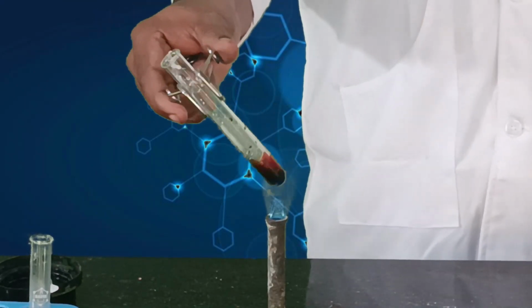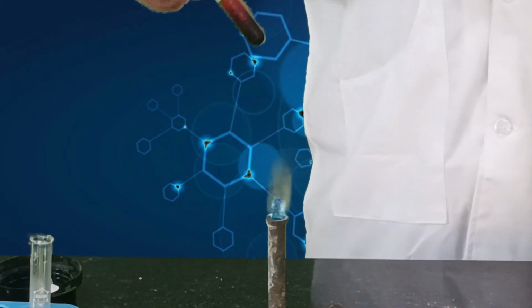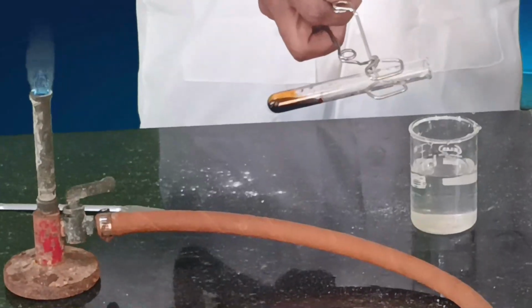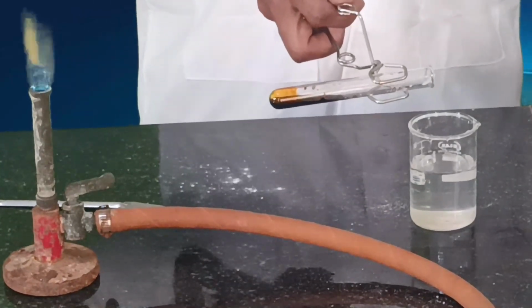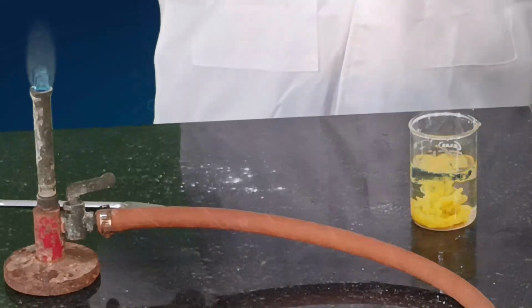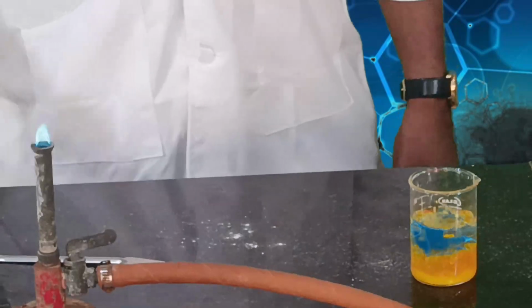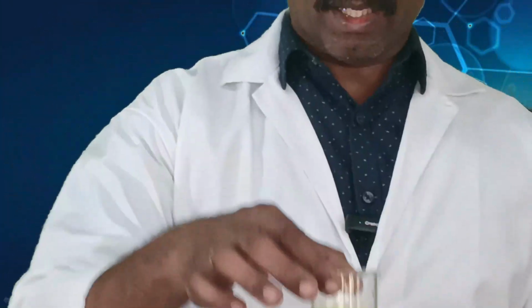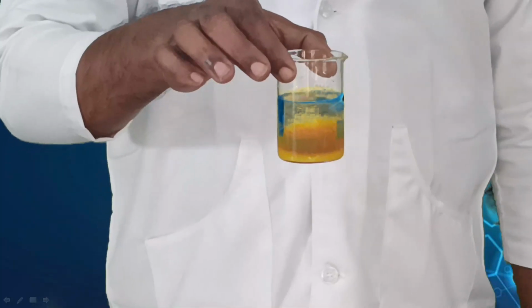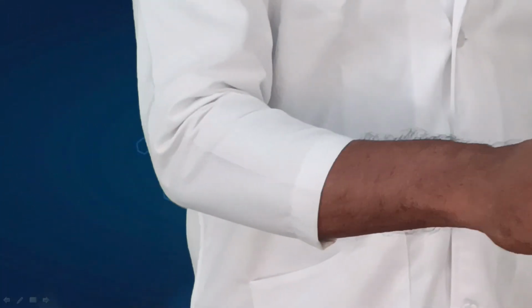Once it turns into dark color, add 1 drop of this to the already prepared sodium hydroxide solution in the beaker. Just 1 drop is enough, and you will get a beautiful fluorescent green color. This fluorescent green color shows the presence of dicarboxylic acid.